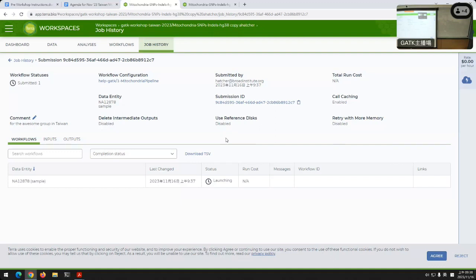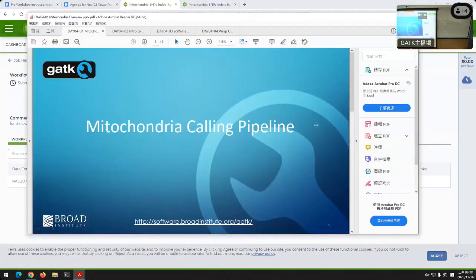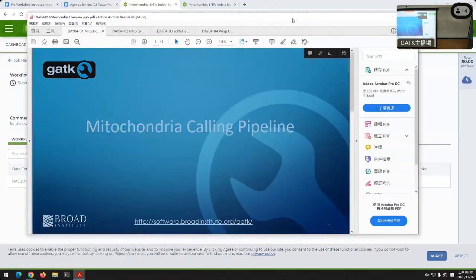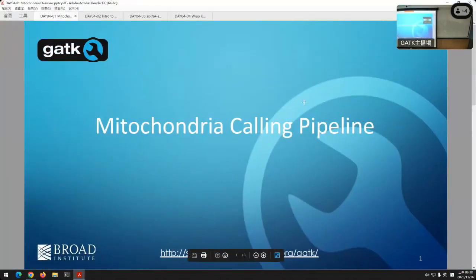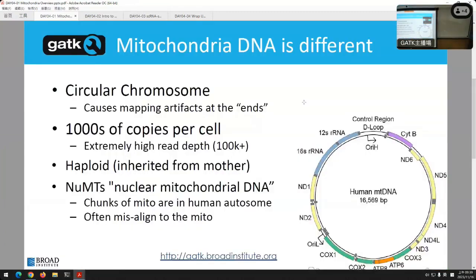So I guess the question is here, I told you I'd tell you why we have this workspace in the first place. And let me hop over here and talk about that a little more now. Yeah, there we go. So why? What is different about mitochondrial DNA, and why do we have a whole separate pipeline for it in a featured workspace? Well, there are a couple things.